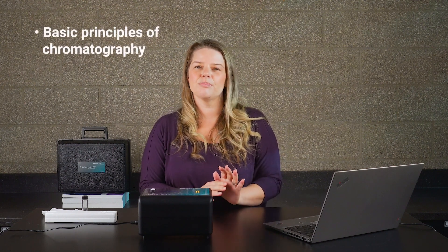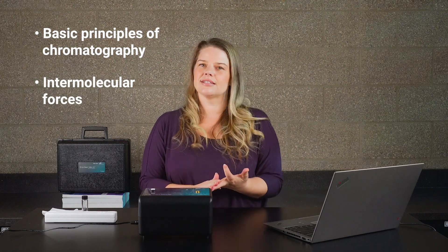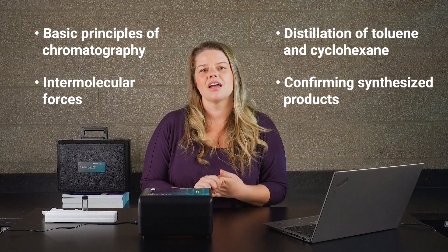I'm excited to introduce you to the Go Direct Mini-GC. It's the latest version in our popular line of Mini-GC gas chromatographs. I'm going to show you a quick tour of the instrument, and then we're going to do some live data collection. Whether you are teaching the basic principles of chromatography, intermolecular forces, distillation of toluene and cyclohexane, or confirming synthesized products, the Go Direct Mini-GC is capable of all of it and even more.